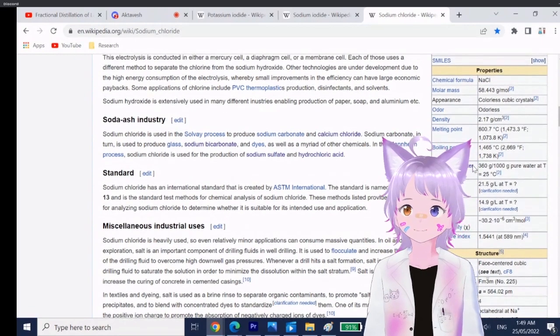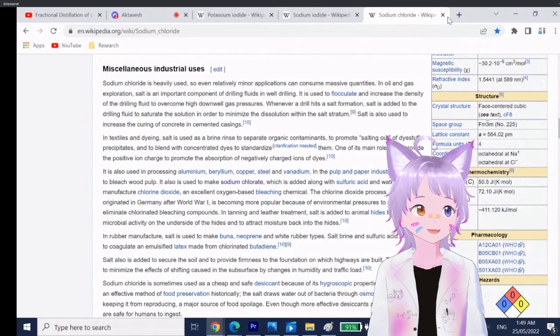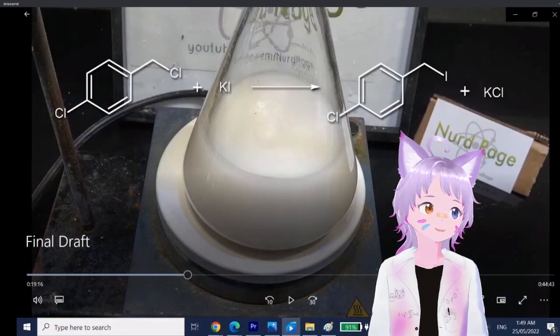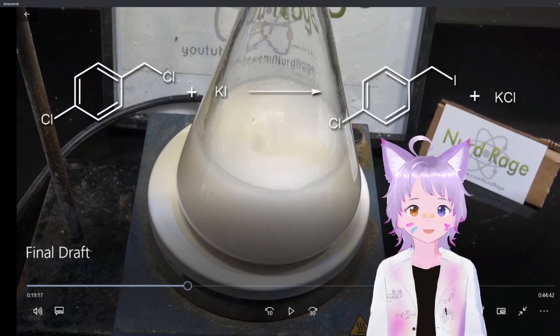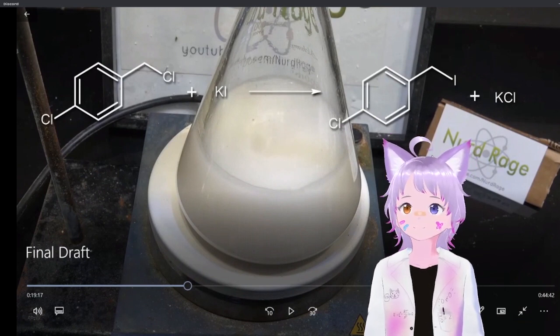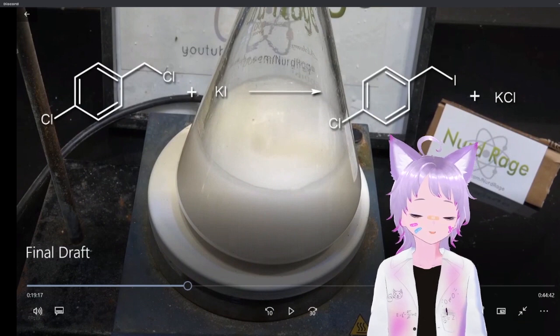Unless maybe sodium cyanide or some other weird thing, but I'm pretty sure he could have just used ethanol instead of acetone. And we will have a higher heating rate. Higher heating rate means the reaction will happen much better. So we'll try it with ethanol. Maybe we're missing something, but I'm pretty sure you could use ethanol instead. Maybe he couldn't get anhydrous ethanol, which is why he resorted to this. Higher temperature, therefore getting better than 12% yield. We'd try all of this anyway, and we could even stream each one.